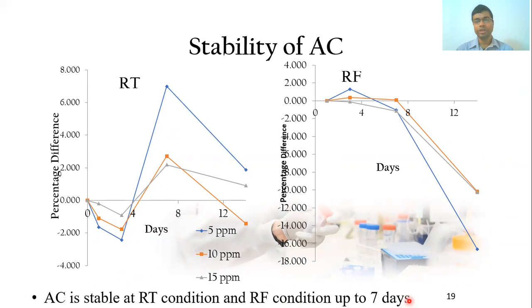And in fact, we have tested for 14 days. For some reason, one of the storage conditions is failing after 7 days. So we have done this test several times, but again, that 7 day period is more than enough. So in other words, if you prepare the samples today, the standard or the samples, you can keep it at room temperature or refrigerated for 7 days until you complete the testing.